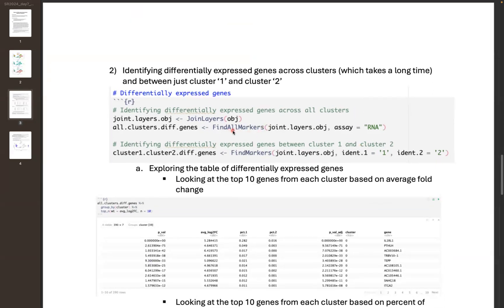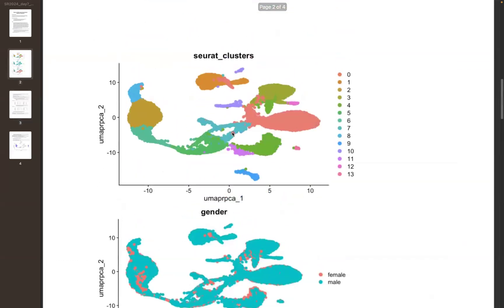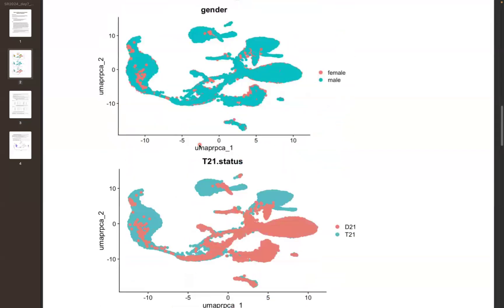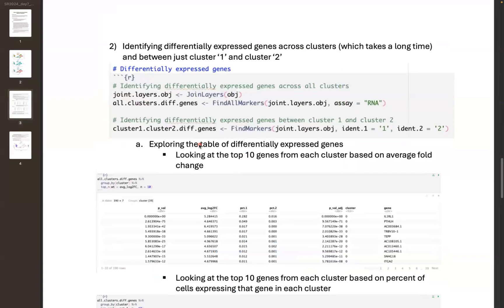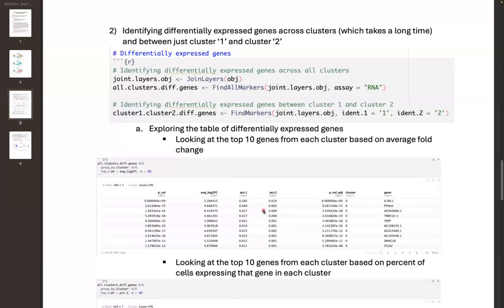The way we do this manually is using two major functions: FindAllMarkers and FindMarkers. FindAllMarkers takes every cluster and compares it to every other cluster iteratively, producing a list of differentially expressed genes associated with each cluster. We can use the tidyverse to organize and plot the data frame that comes out of FindAllMarkers — allowing us to sort by cluster, log fold change, adjusted p-value, or any of these values to better understand what genes are associated with each cluster.